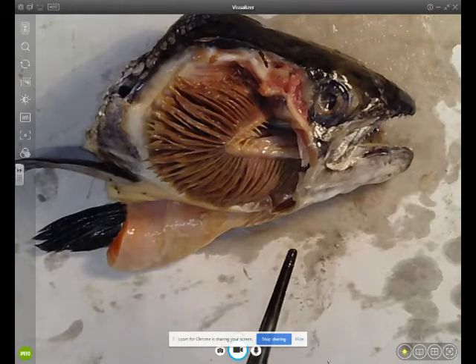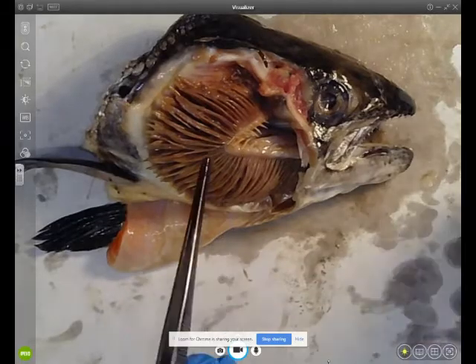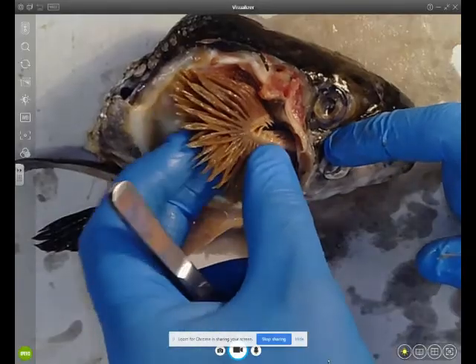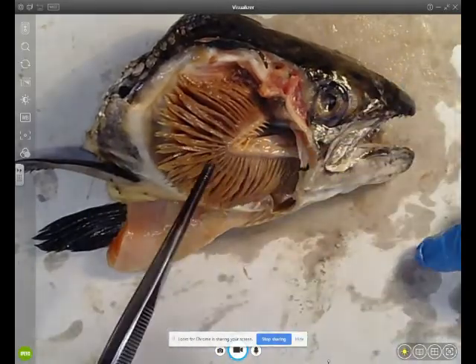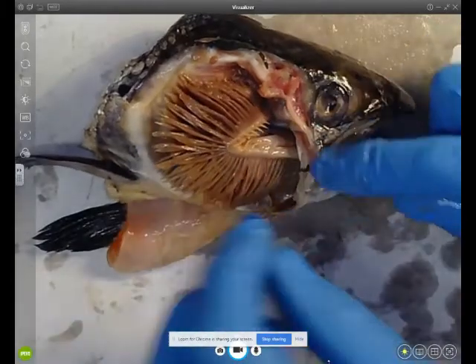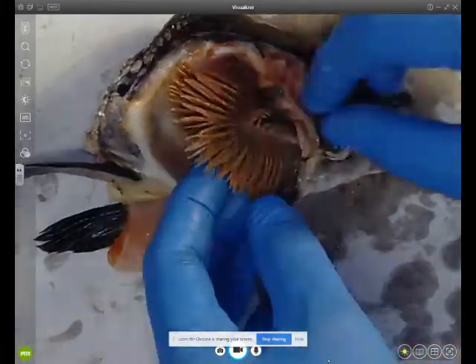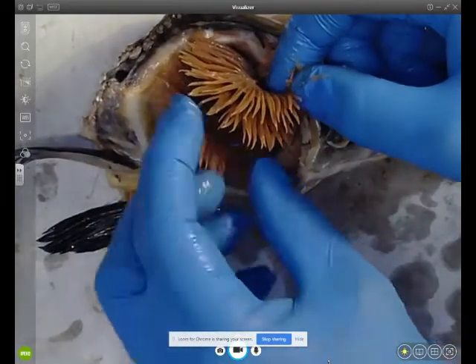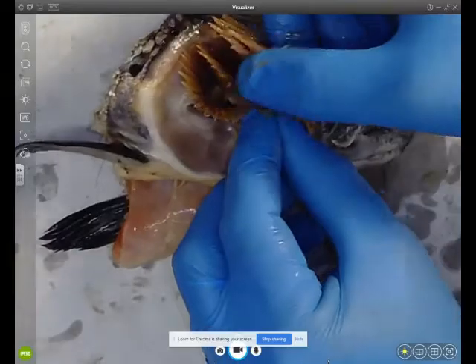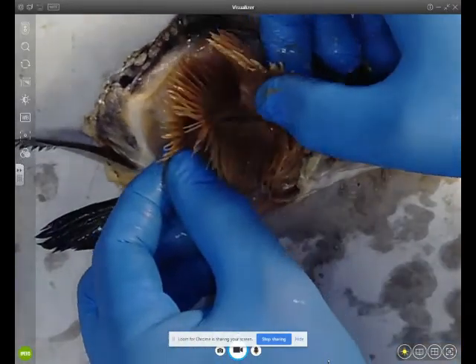These gill filaments are responsible for absorbing oxygen — oxygen diffuses from the water through the gill filaments. There are literally hundreds of gill filaments, and on those filaments are small lamella. These are microscopic; you need a microscope to see them, and they further increase the surface area.